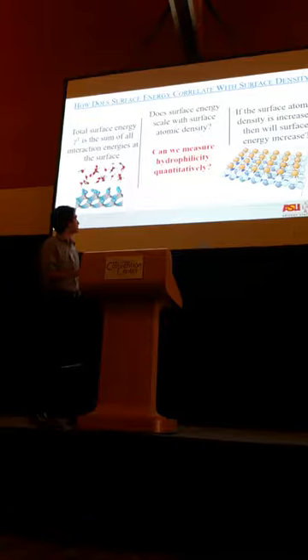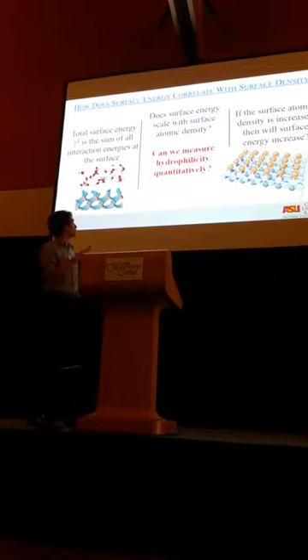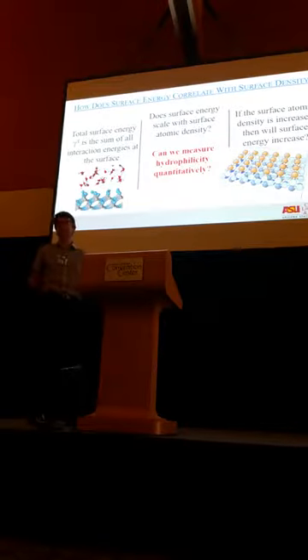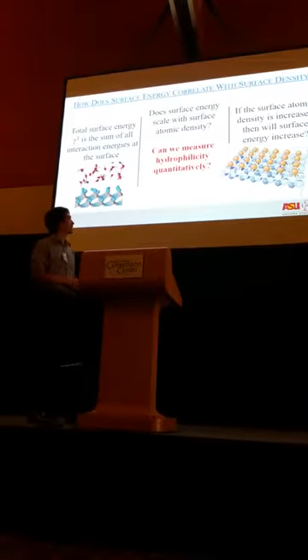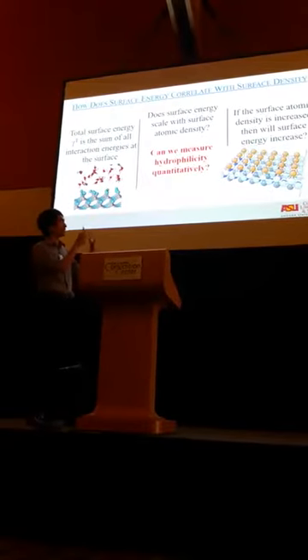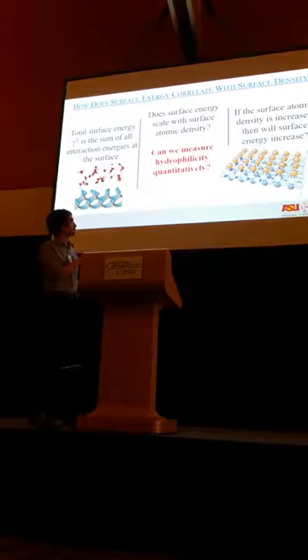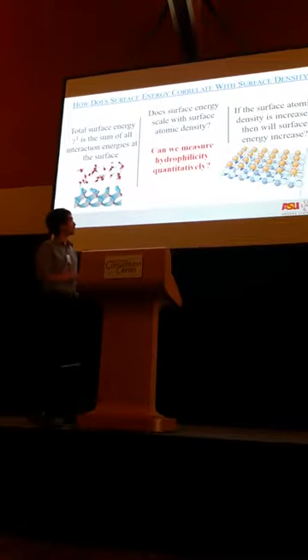By testing this correlation, we can answer the question if we can measure hydrophilicity quantitatively by 3LCAA. This illustration here in the bottom right is a good illustration of our silicon 100 crystal with our surface atoms demonstrated by these orange atoms here.